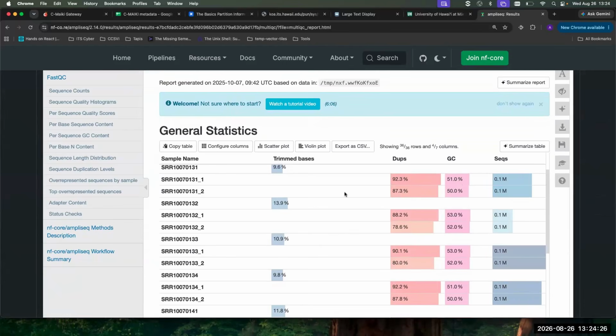So the nice thing about that output section of the website is it gives you an example of what your outputs would look like for a typical sequencing run, which I think is really helpful. If you run our pipeline, you will get a folder with those same folders and with those same HTML files. And there are some really nice little perks in there.